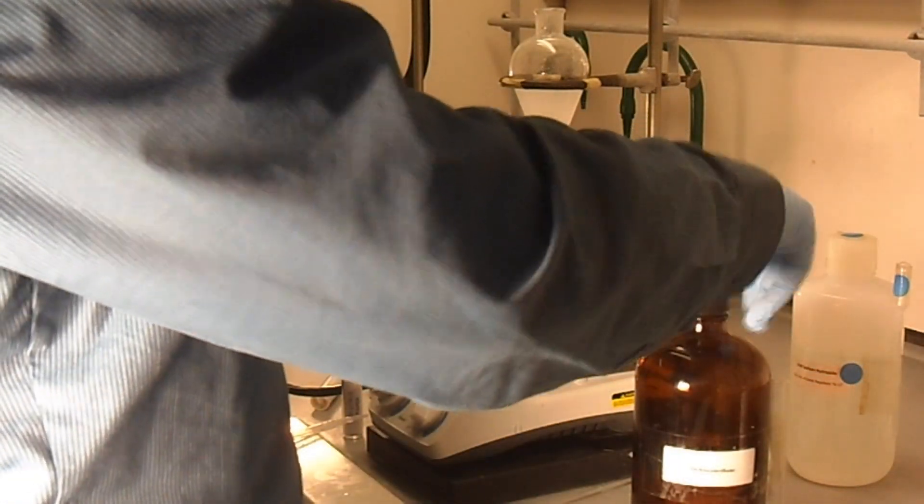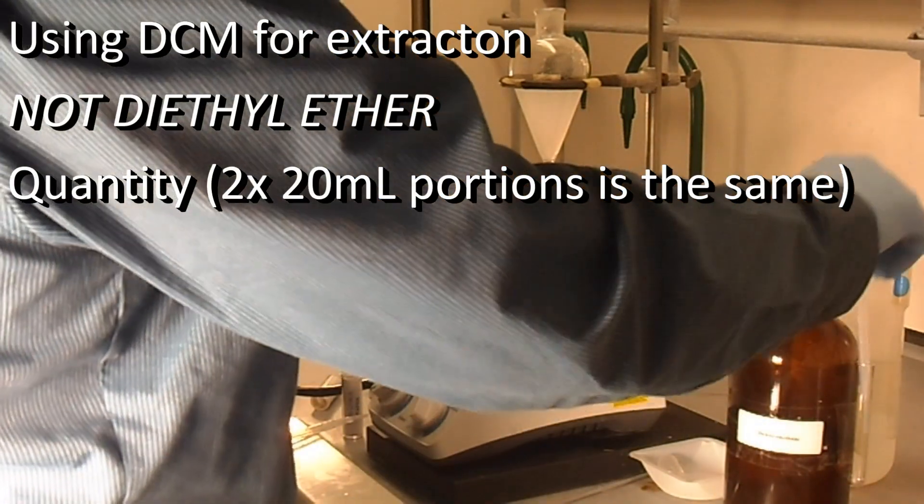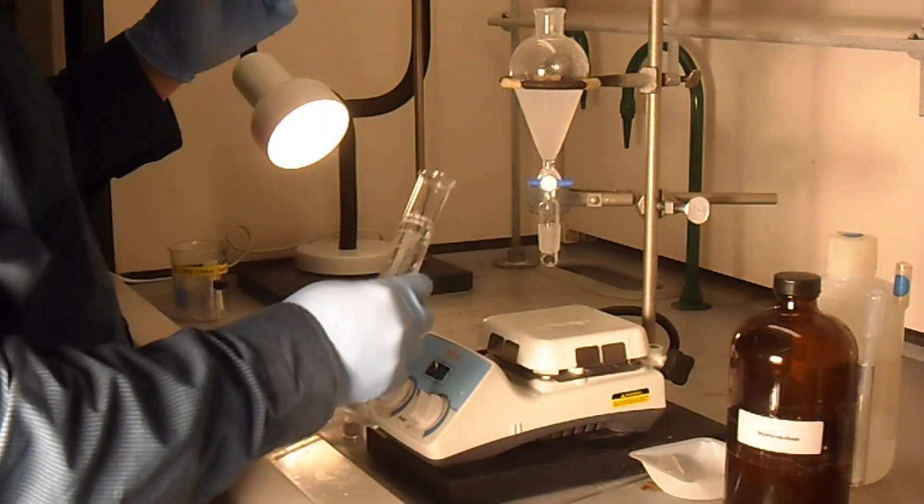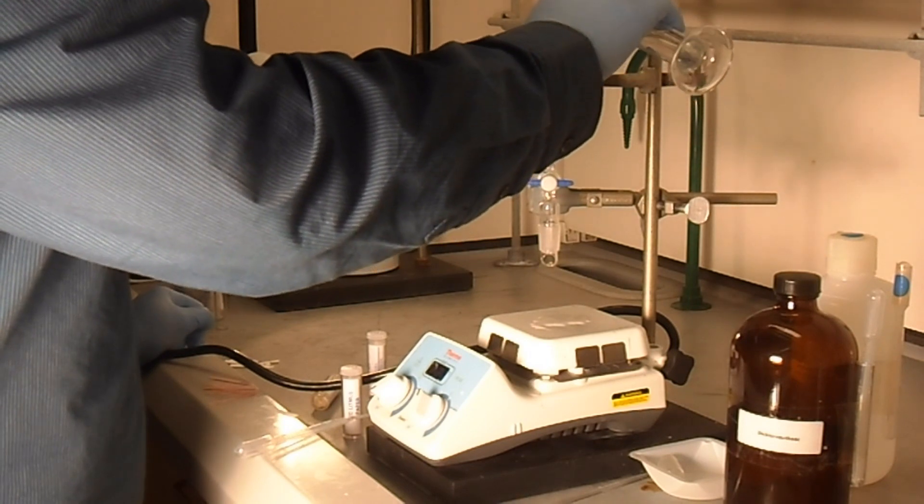So once our salt is dissolved, we're actually going to be using dichloromethane for our extraction, not diethyl ether, so we're going to put 20 milliliters of dichloromethane into our sep funnel and perform an extraction.